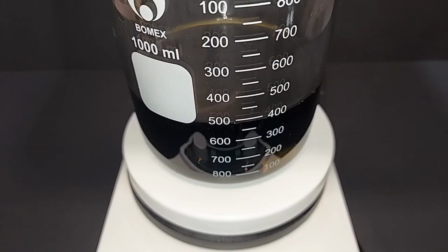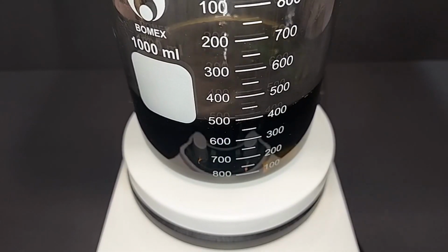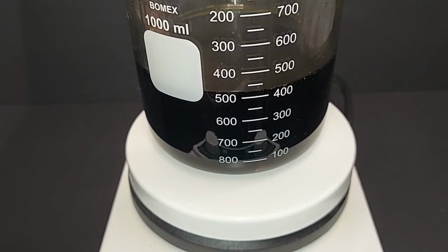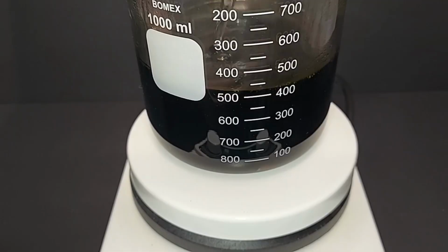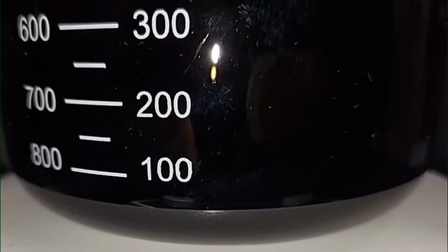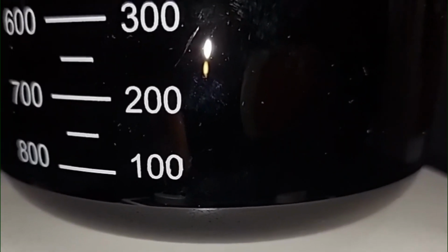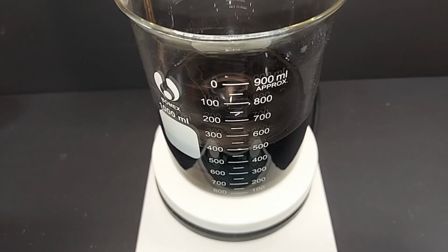A little closer view as I add the hydrogen peroxide. This will be the last addition of the 150 milliliters of hydrogen peroxide. The copper is almost completely dissolved here. You can just see tiny specks kind of swirling on the bottom there. Almost done. All of the copper is dissolved. I did end up adding another 60 milliliters of hydrogen peroxide after I said I was done, but it did the trick, and everything's dissolved. It was being heated, of course, and so we lost some water.